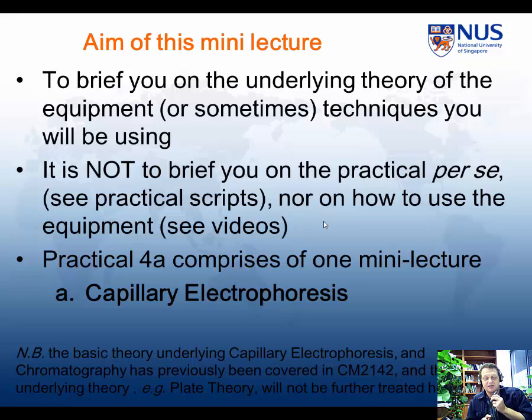But beyond that type of level, I won't be talking about the practical. I'm also not going to be talking about the operational aspects of the equipment you're using. How to turn the equipment on, how to use it, how to get the data off, how to shut it down. That's covered in the video presentation on capillary electrophoresis.